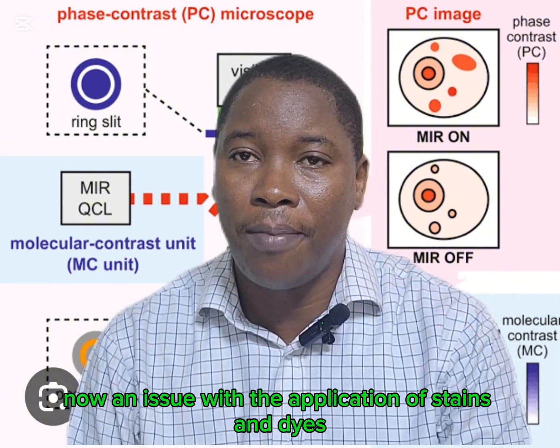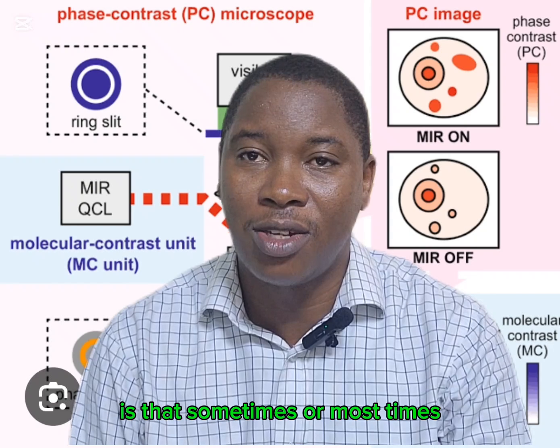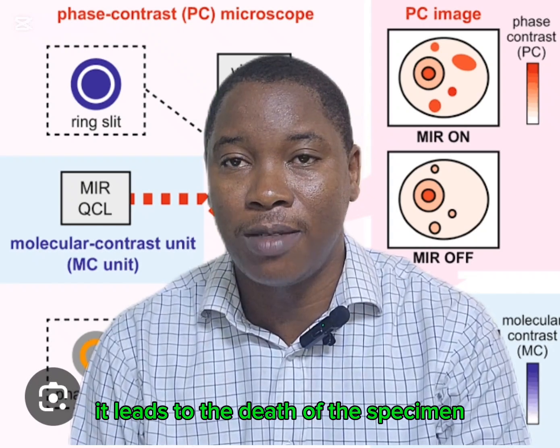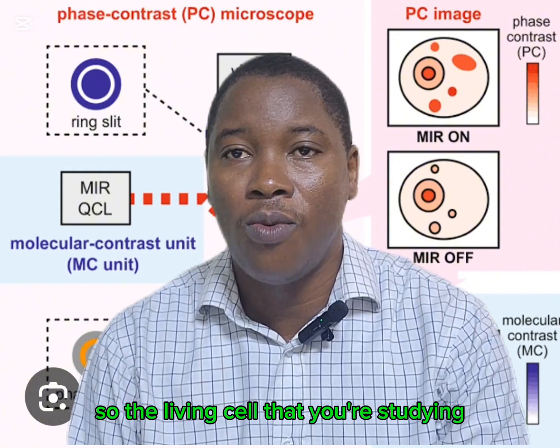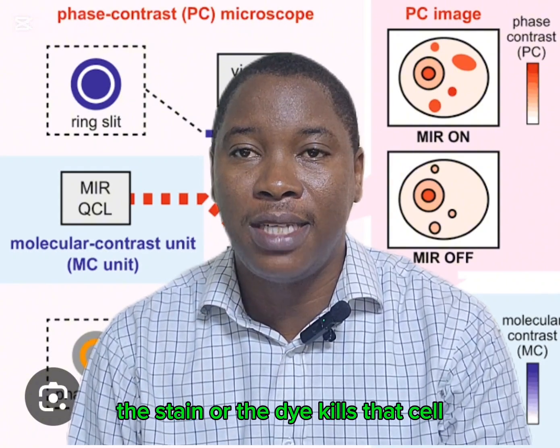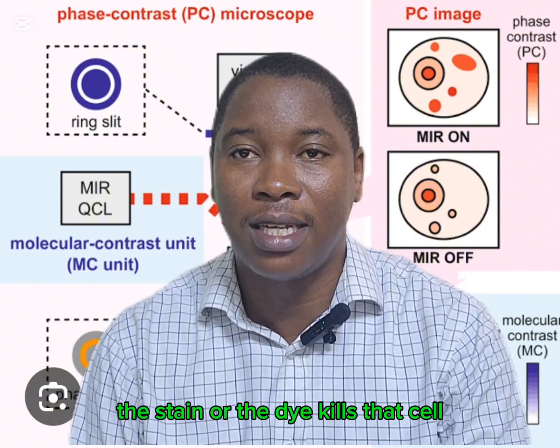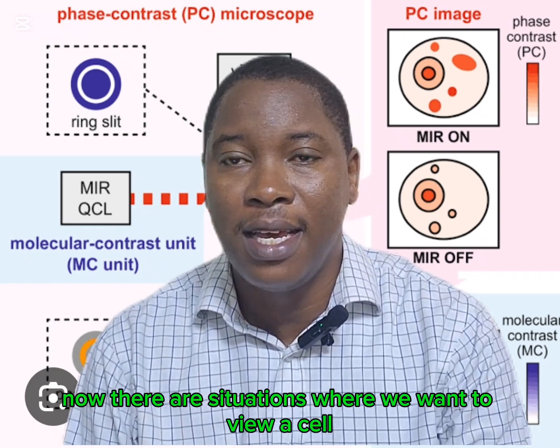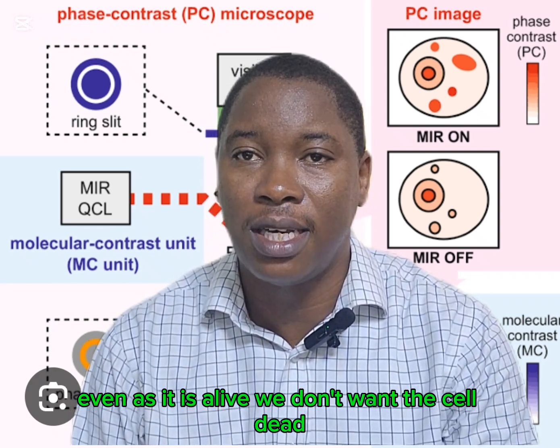Now, an issue with the application of stains and dyes is that sometimes or most times it leads to the death of the specimen. So the living cell that you're studying, once you stain that cell, the stain or the dye kills that cell and then you view the cell. Now, there are situations when we want to view a cell even as it is alive. We don't want the cell dead.